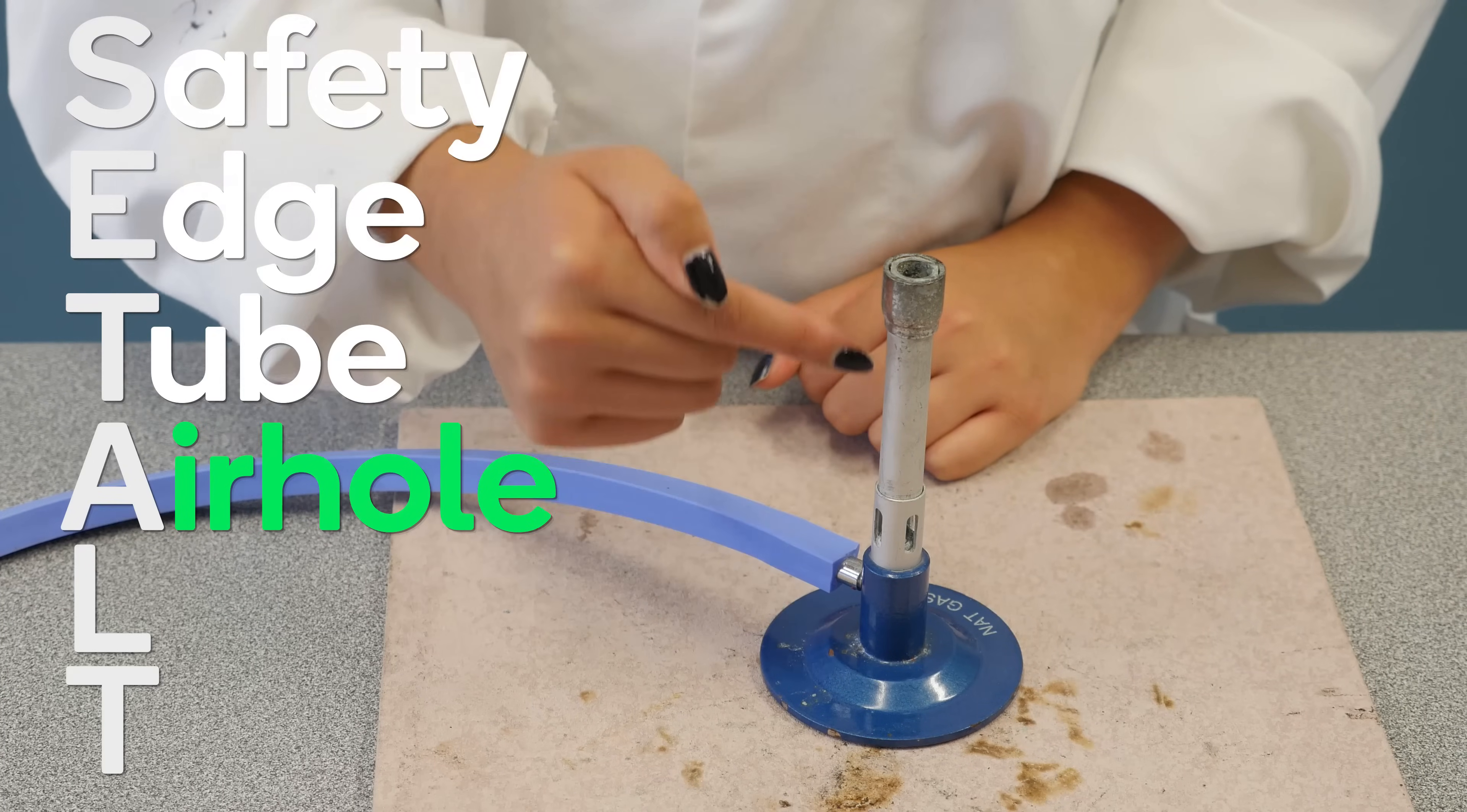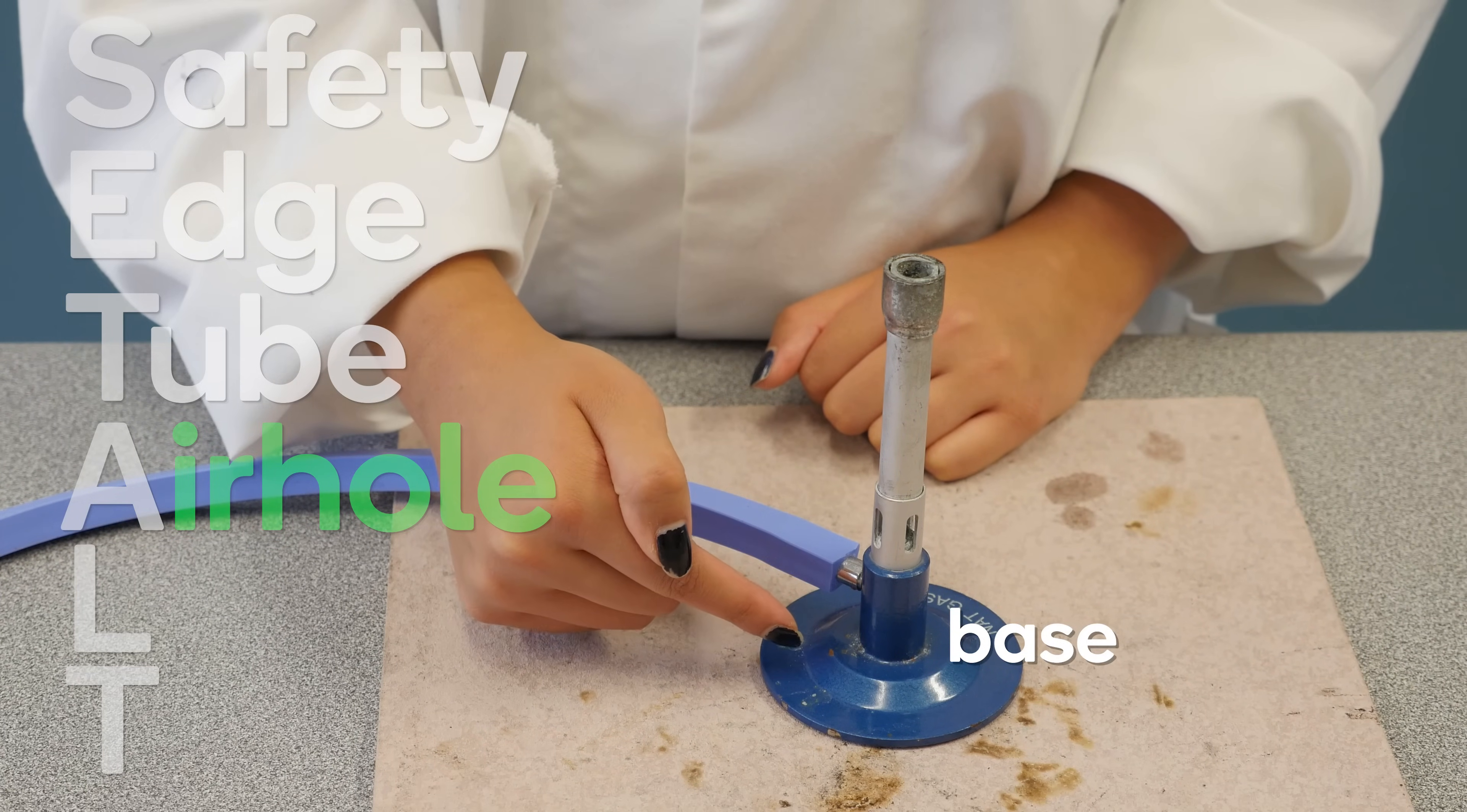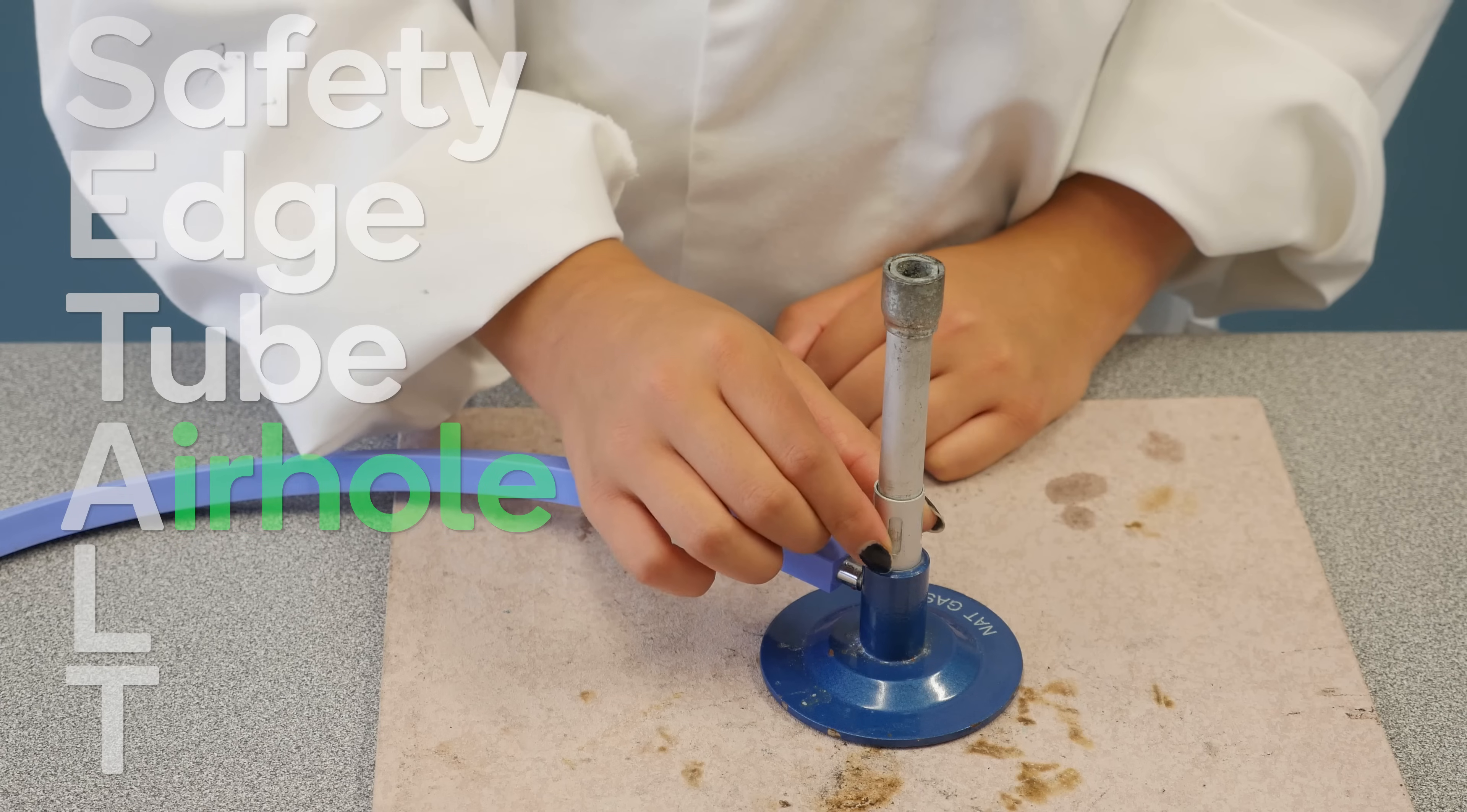A is for air hole. The air hole is located at the bottom of the barrel, near the base. It can be opened or closed by turning a metal ring, called the collar. This controls the amount of air and oxygen that mixes with the gas.